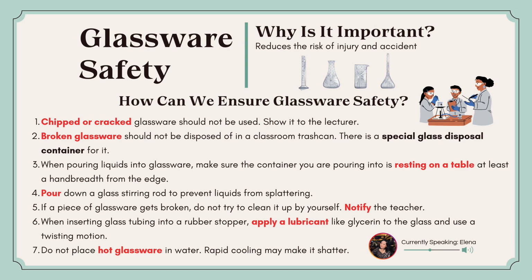How can we ensure glassware safety? First, chipped or cracked glassware should not be used and shown to the lecturer. Broken glassware should not be disposed in the classroom trash can. Instead, it should be disposed in a special glass disposal container.